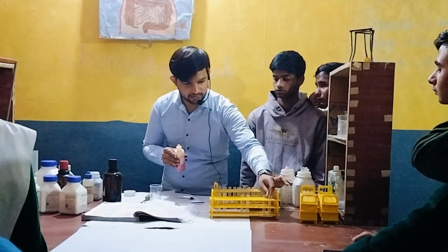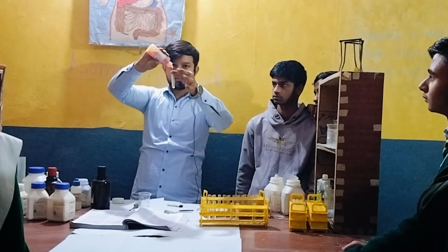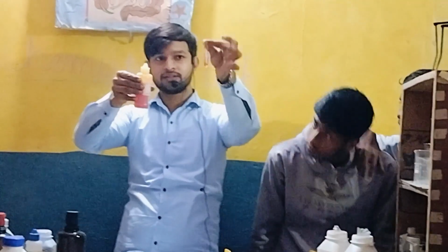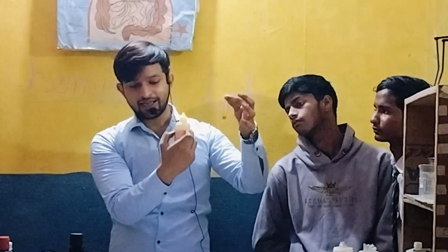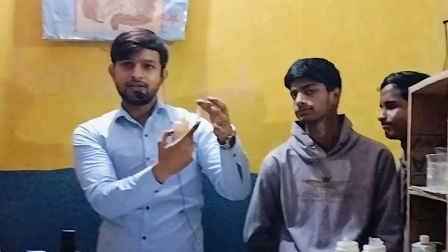Let's observe. So this is acid. Now see. Does the color change? See. Yes, this is orange color. See, and this is red color. There is difference in the color. So this is acid. So methyl orange when dipped into acid, then it converts into red color.